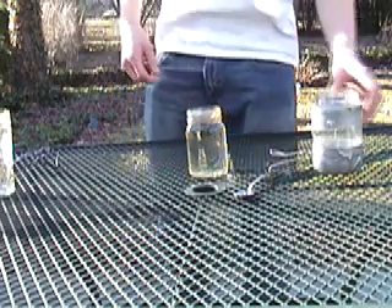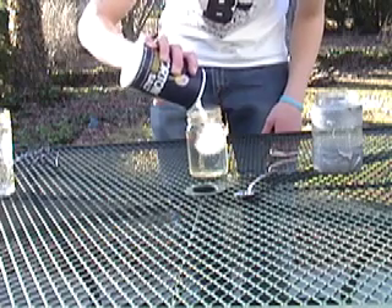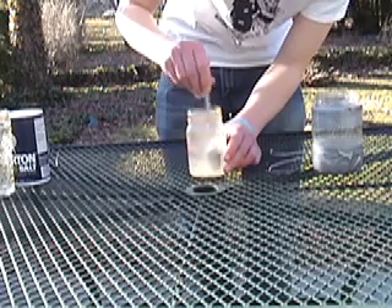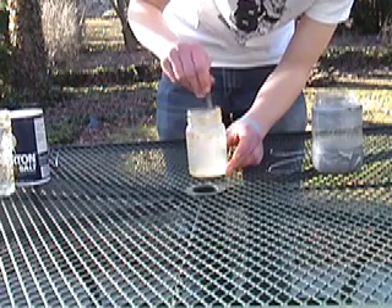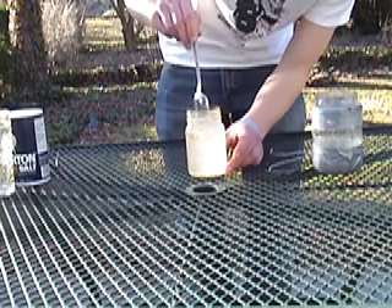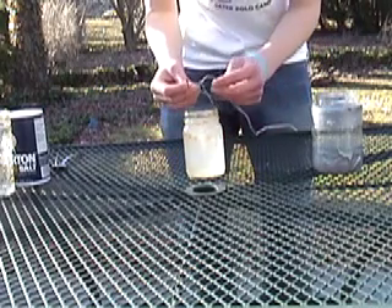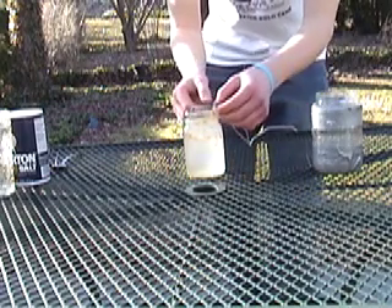First you're going to want to add your salt — a good bit of salt. You're going to dissolve it. Alright, I've got two screws attached to my 15-volt converter that I actually got off a stereo system that broke.